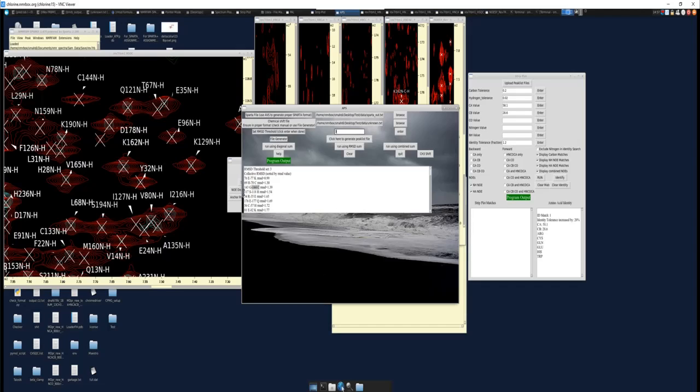This glycine to cysteine doesn't. The serine to histidine doesn't, right? So using this, you can immediately start to cross out some of these alternative potential options that you could have.